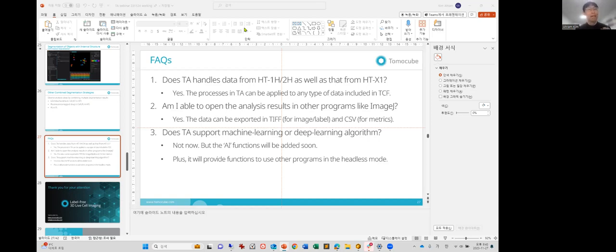By combining the fiber-like feature, we can segment those mitochondria. And since the simple RI value does not guarantee the segmentation, we added relative RI values for the segmentation. So for mitochondria, we can use the RI value for basic segmentation, but for better segmentation, we can apply the fiber-like features.